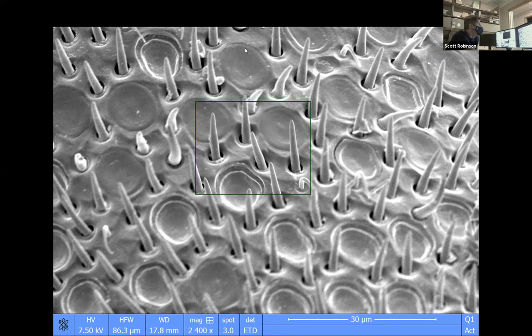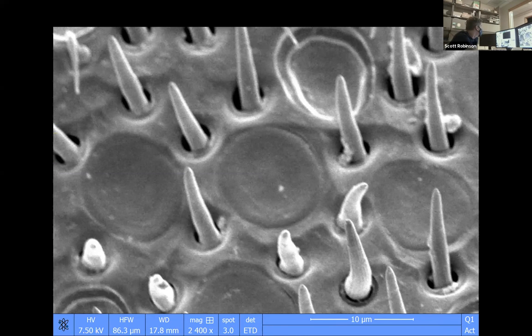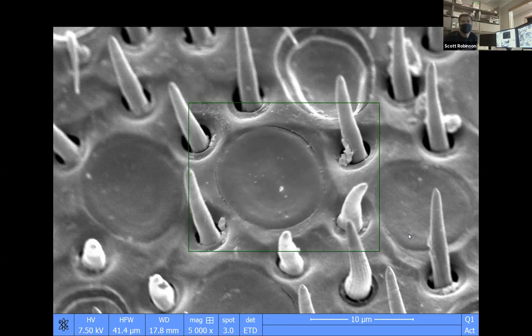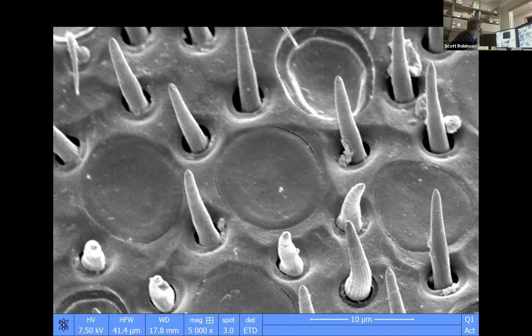And then we also have these things called placoid sensilla that are on there. Those are plate-like sensory structures, like this one right here. I'm not really sure what it can do. You would think that maybe it could process sound because it's sort of a drum-like shape. There's always, as much as you think you know about insects, more and more, and it's really cool. Yeah, for sure. Never bored.